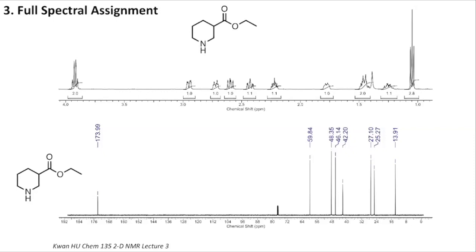So let's begin with my favorite place to start, the proton NMR. Before we get going on analyzing any of these interesting peak shapes, we want to give some names and labels to these peaks so that we know how we can refer to them later. Again, I'm going to use letters for the protons, and then we'll do some numbers for the carbon in a bit. So starting with A and moving down the alphabet, we'll get all the way from A to J.